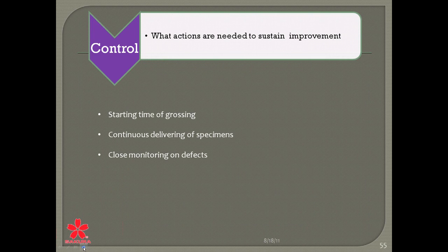So at the end, I think I'm going, no, this is the control part. So what we did at the end to sustain our improvement, we had the starting time of grossing. We just made it a little bit earlier.